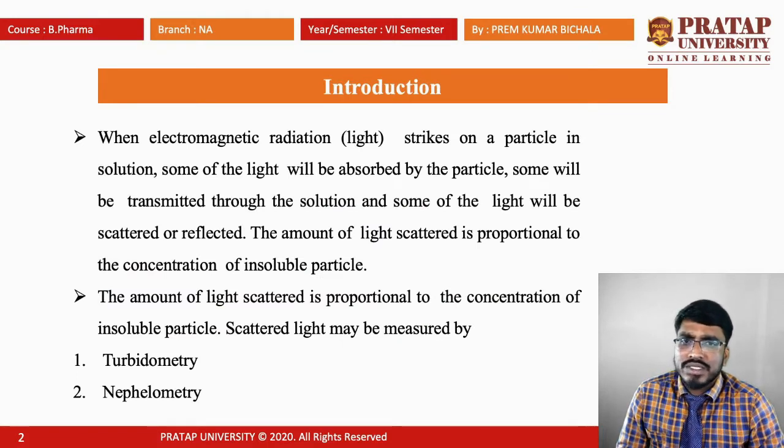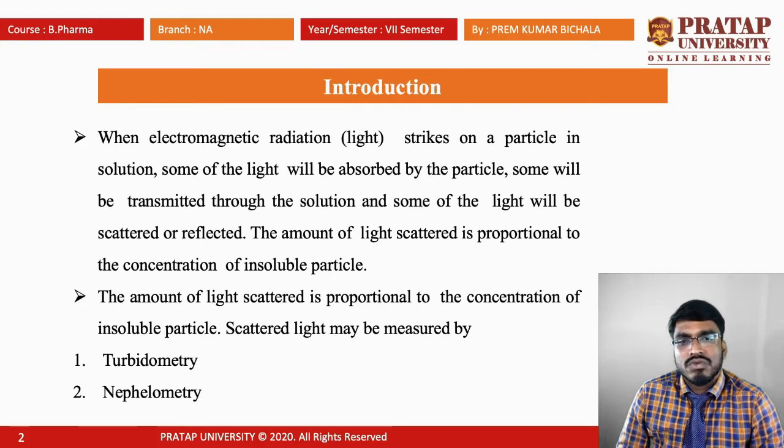Coming to the basic introduction to Nephelo-Turbidimetry: when electromagnetic radiation, that is light, strikes a particle in a solution, some of the light will be absorbed by the particle, some will be transmitted through the solution, and some of the light will be scattered or reflected.